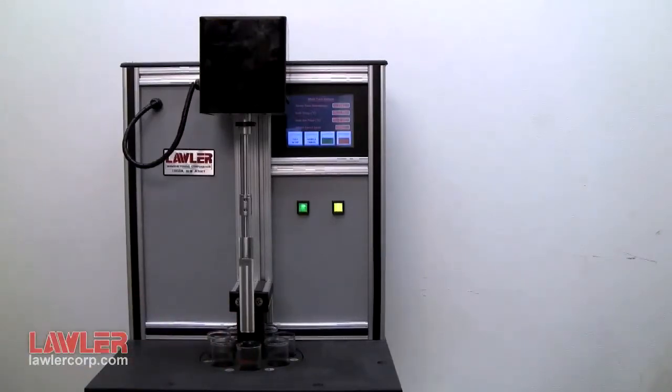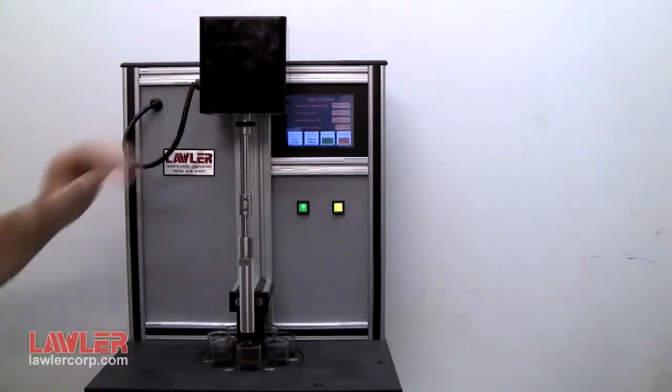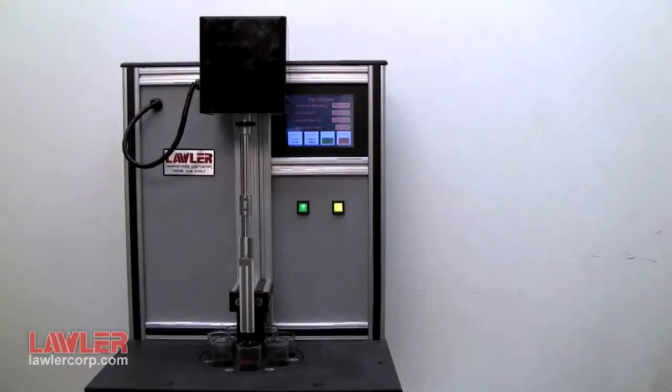Repeatability is improved by our selection of a precision motor. They do not have their RPMs vary like AC motors when line current fluctuates from the local power company.